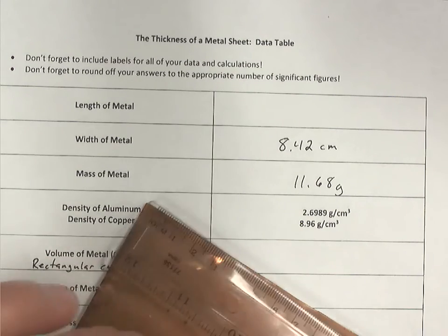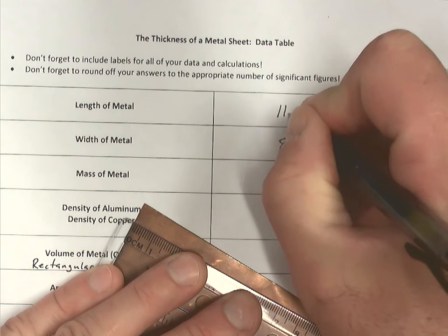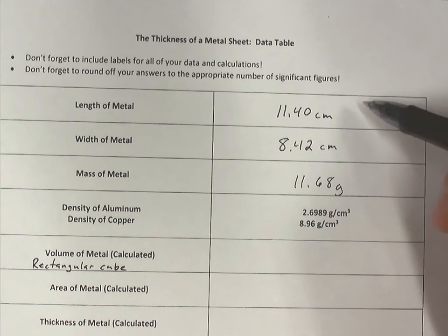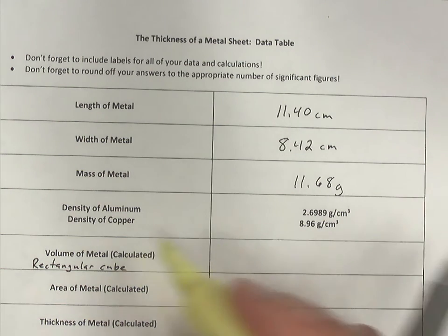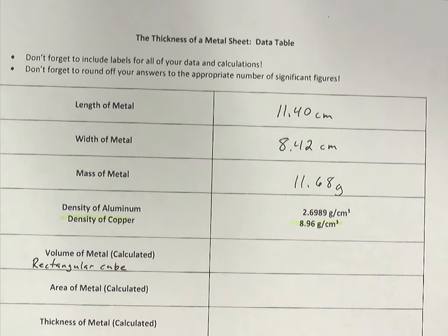And my length is right exactly on the 11.4. So I'm going to go 11.40. So now that I have my length, my width, and my mass, those are the only measurable things that I can use. I need to use the density of copper for this problem, because my sample is definitely copper and not aluminum. And I need to calculate the volume.